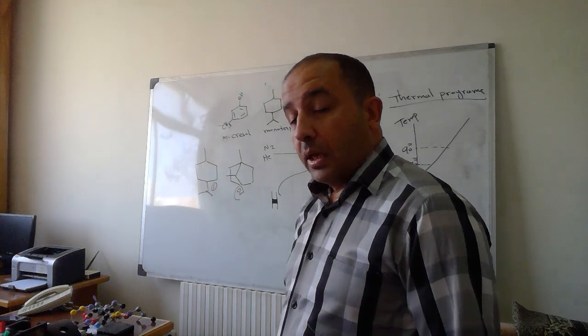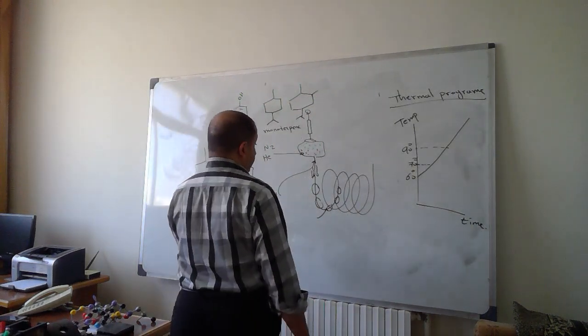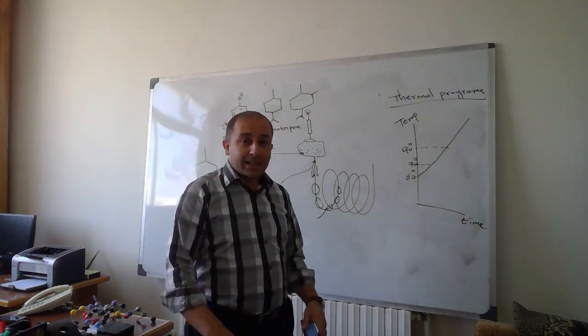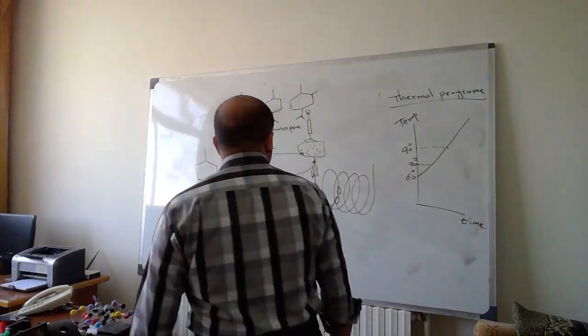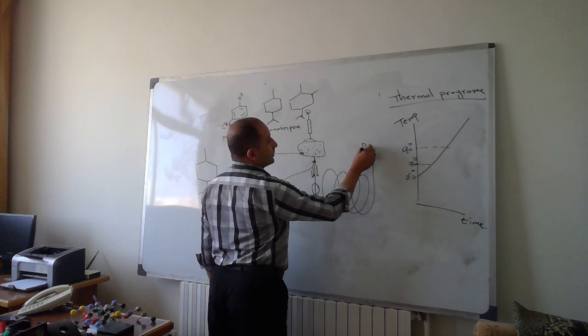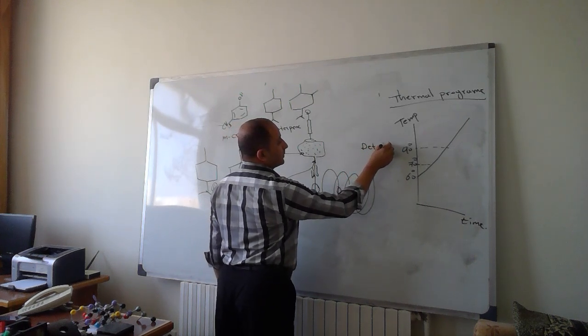Okay. Now, after separation of compounds as clouds of analytes, they will be detected by a suitable detector.